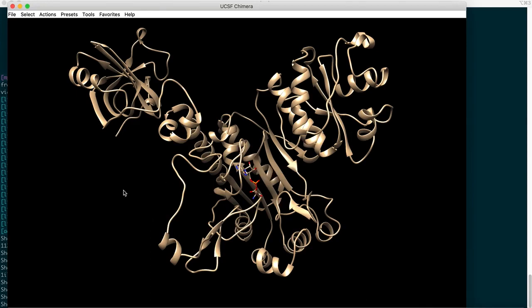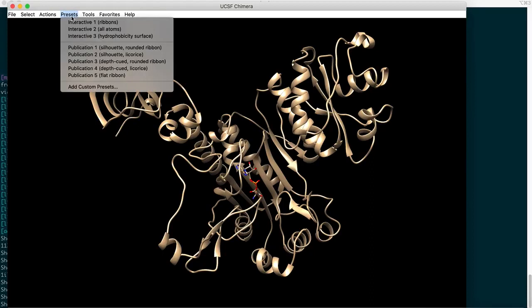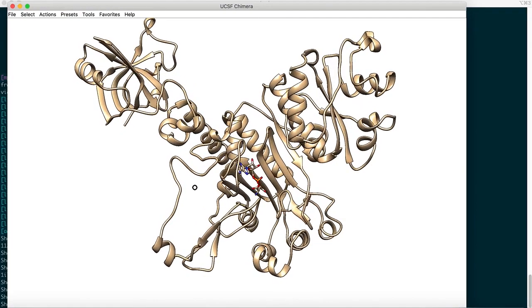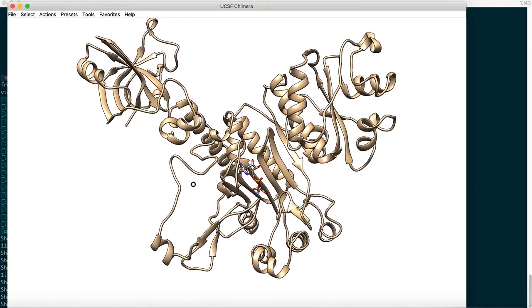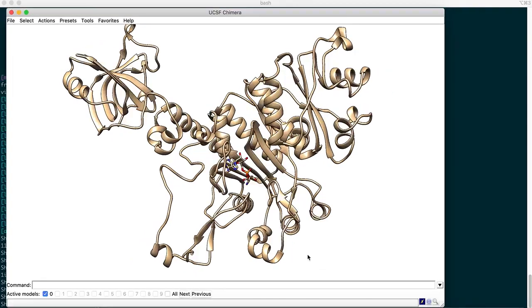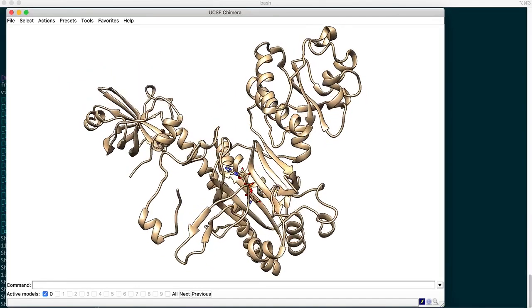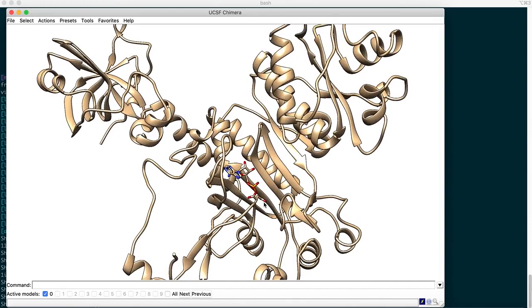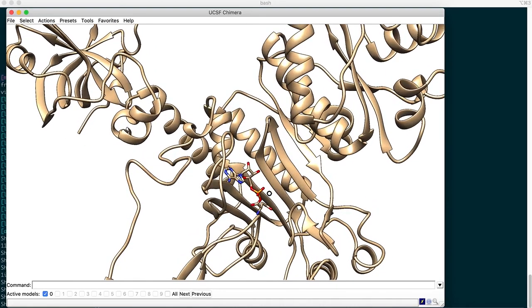An interesting and very handy feature of Chimera is that you can literally hover over any part of the molecular structure and it will show you which residues are involved in forming that part of the structure. For the ligand, if you hover over it, you'll find the residue name is AMO. We'll change the background from black to white - just like we did for VMD - using the preset menu on top. Going to Publication 1: Silhouette Rounded Ribbon, the background changes to white and we can clearly distinguish between the different molecular fragments.